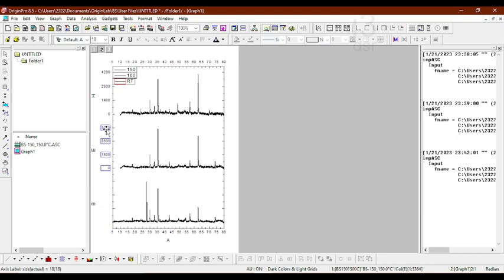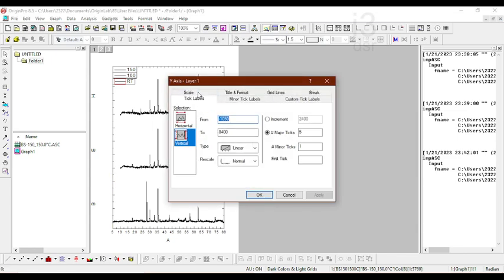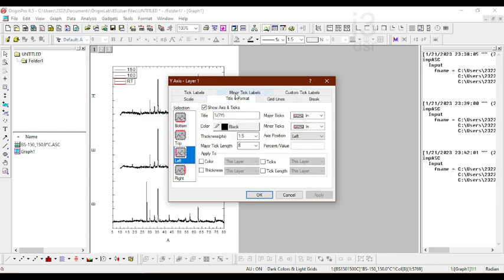Similarly, this is the second graph, click delete, and on top I also do not want any units. Once you get this blue diagram, you just click delete and everything disappears. Now we have a neat graph with three comparison data, and we do not want all these inner facing lines. So I double click on this, go to tick labels, and it shows show major. Yes. Here it shows inside.